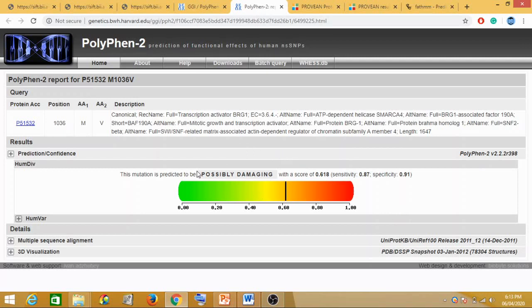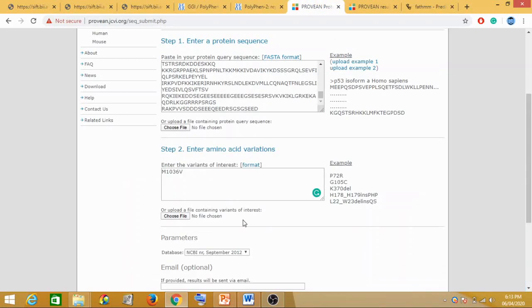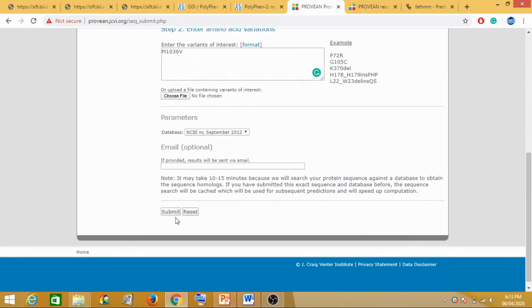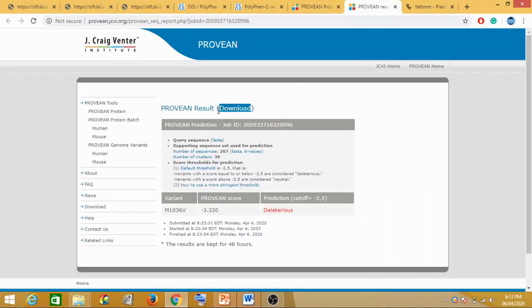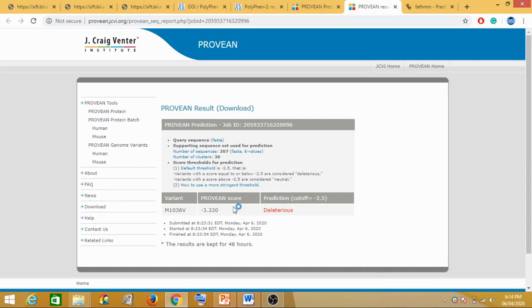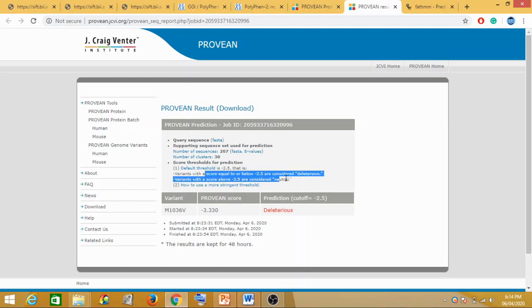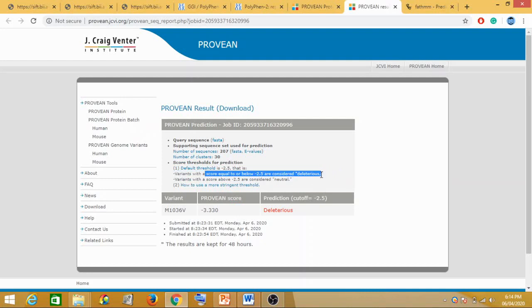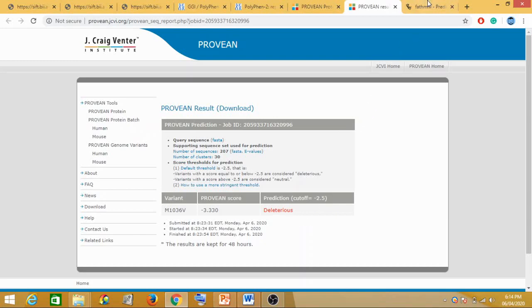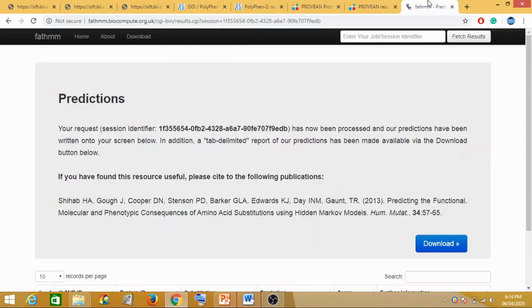Next is your PROVEAN. We had entered this and clicked on submit. This is the result: M1036, PROVEAN score -3.330, prediction deleterious. Why is it deleterious? Because the cutoff here is -2.5. If your score is equal to or below -2.5, then it should be considered as deleterious. So because our score is less than -2.5, the prediction we have got here is deleterious. So again, using PROVEAN, we observed that the mutation is deleterious.